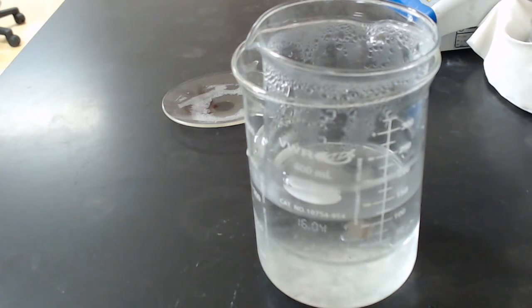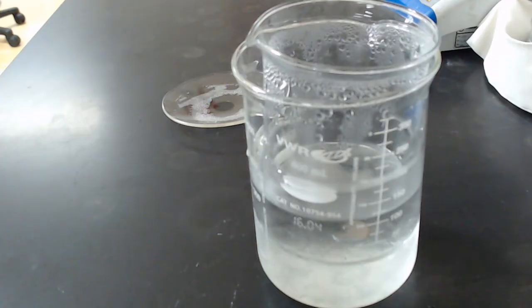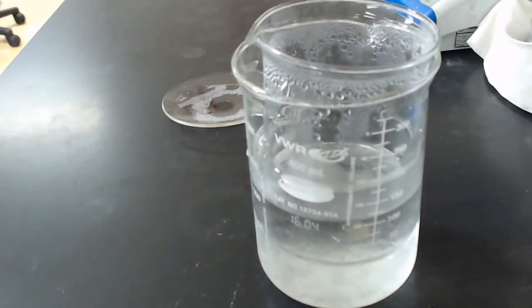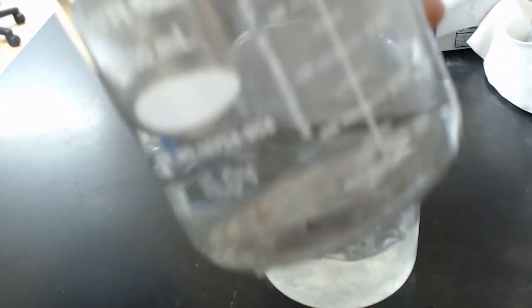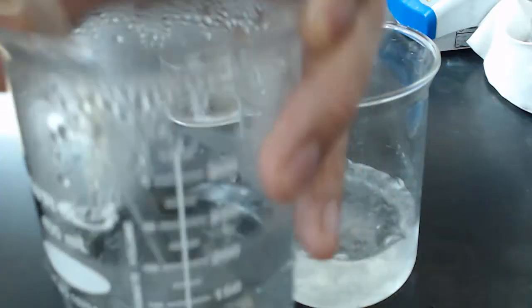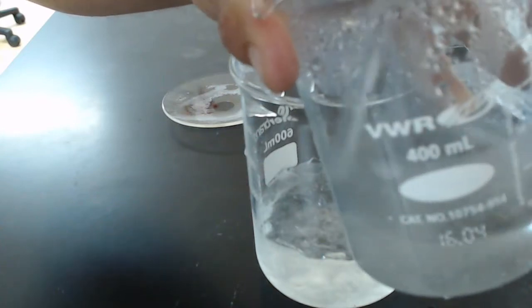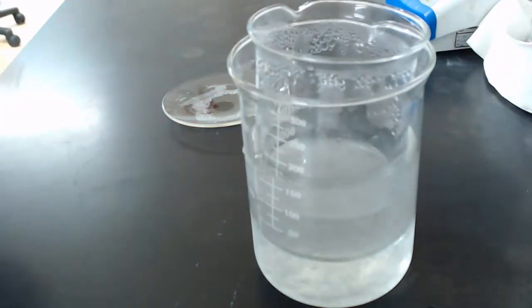You should start to see some crystals forming as it cools off, but sometimes though they don't want to form on their own, you may need to seed the glass. Seeding the glass, you just get a glass stirring rod and scratch the inside of the glass on the inside of the beaker under the level of the liquid. So, let's see if that works to initiate your crystallization. You get a view there. You just scratch the glass. Yep, that worked. You have crystals forming now. That white powder is pure acetanilide. As soon as it starts, you don't want to seed anymore. Just letting it down to be ice cold, and then we'll do the filtration.